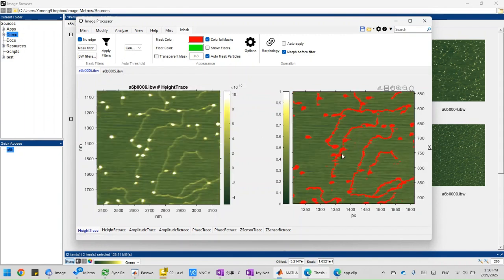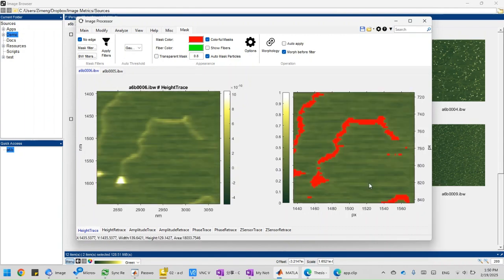So you have a bunch of stuff here, right? We are only interested in analyzing DNA. So we want to know the size of the DNA, so we can filter other things out, right? To know what the size of the DNA is, for example, this piece of DNA, let's zoom in a little bit further.